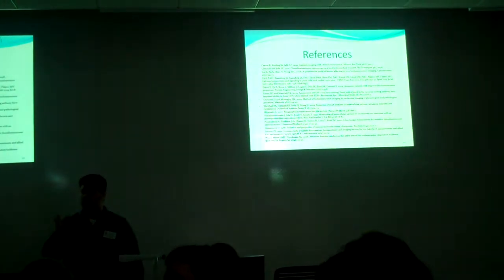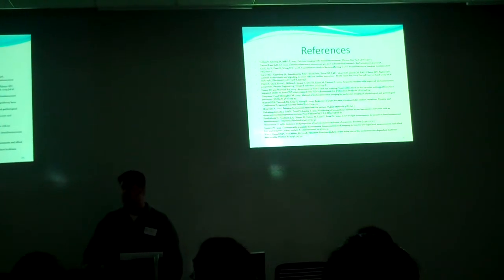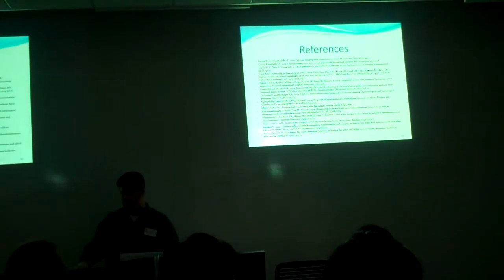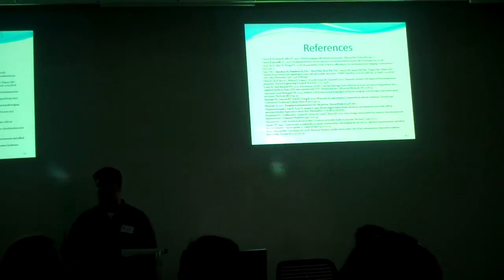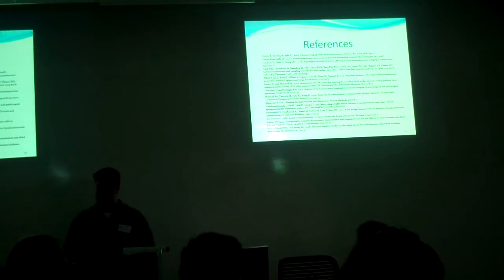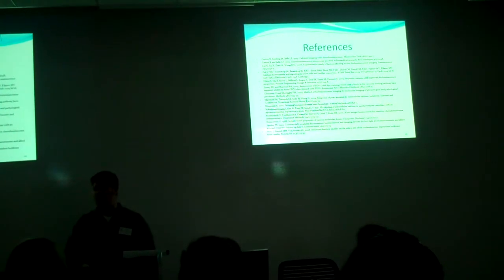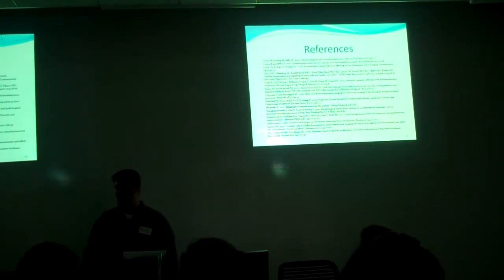I was asking if there were knockouts, mutants that were available to study. So in our lab, Dr. Marshall has been studying several knockouts that are related to the calcium or the yeast vacuole-associated proteins, these channels that pump the calcium in and out. And she has some interesting data from previous studies on that, which we will also try to replicate in this machine. We're just not there yet, but that's soon.